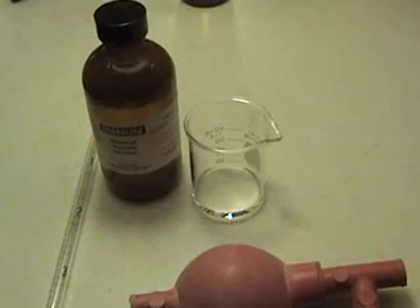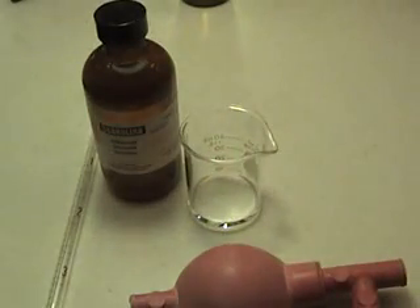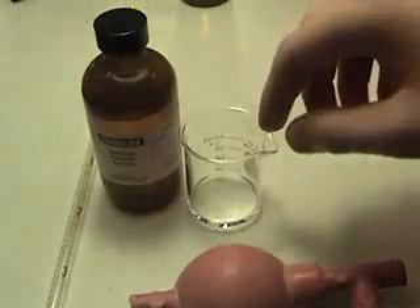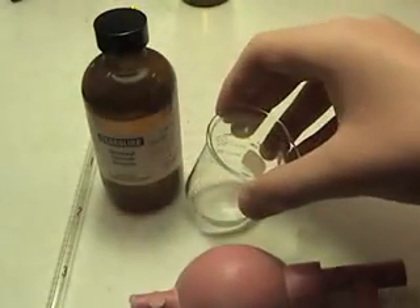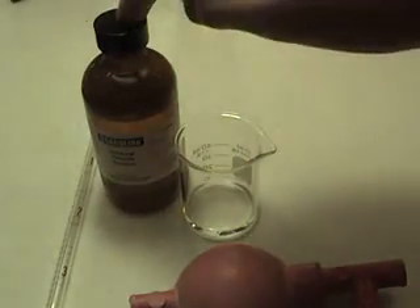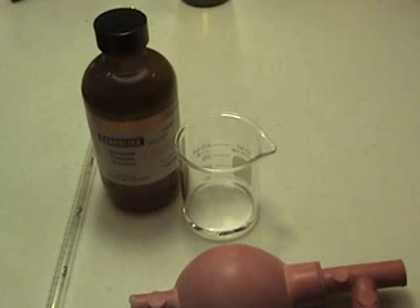If you want to make colored nylon, you want to add a couple drops of food coloring to the hexamethylenediamine. Now when you place the sebacoyl chloride into the beaker, you want to make sure you have the beaker on the side and you want to drip the sebacoyl chloride down the side of the beaker so that it forms a thin layer of nylon between the two chemicals.